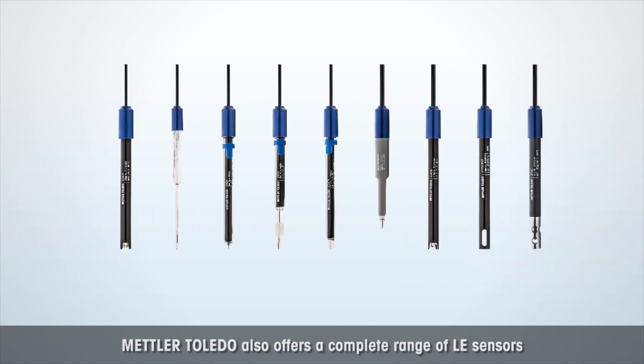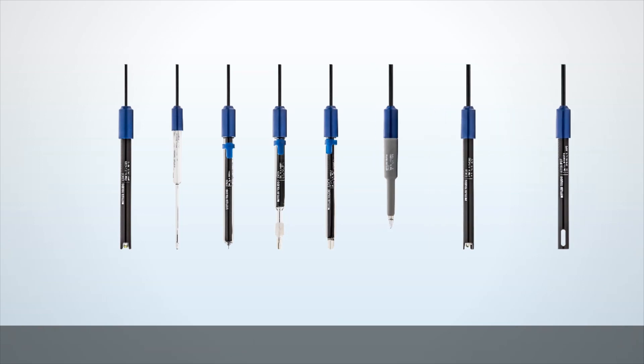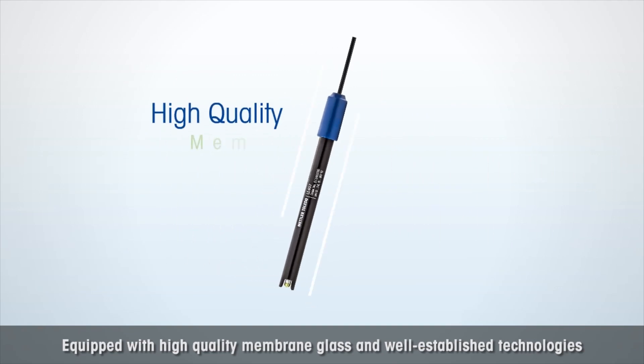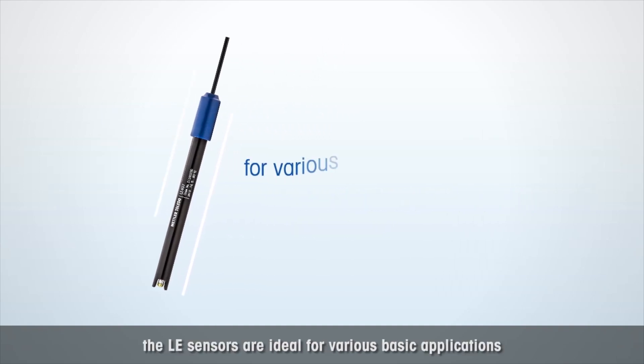Mettler Toledo also offers a complete range of LE sensors which are a perfect match with the Five Series meters. Equipped with high-quality membrane glass and well-established technologies for trusted results, the LE sensors are ideal for various basic applications.